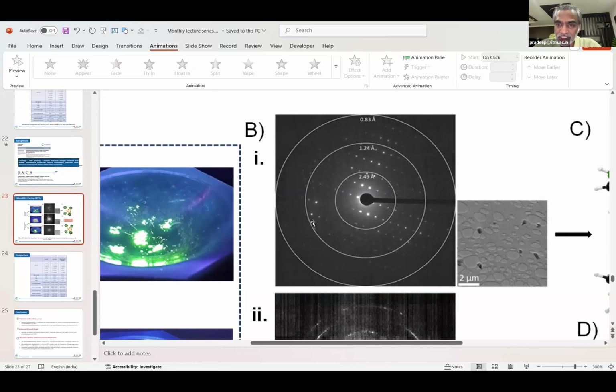Maybe it is important for Brijesh also, for the kind of crystals he is looking at. A few water layers are not there. You have a crystal and then a few atoms or layers are missing, and then another step where atoms are missing. Now you are taking diffraction from this. You're working with microcrystals, so it's not one crystal having the same atom density across. In that 1 nanometer spot size itself, you have variation. Is that reflected here?